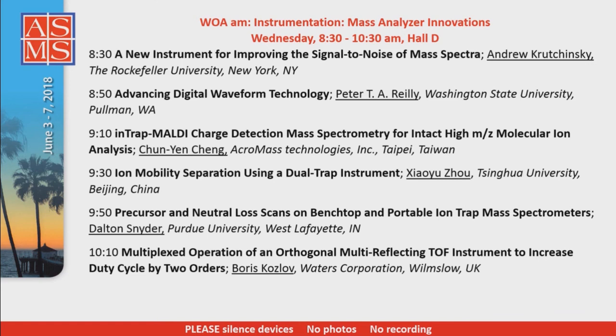I have one question. How long does it take from the time you say, okay, change, to you actually changing what's coming out? Is this a chromatography time scale, or is it much slower? It's a fraction of a second. Fractions of seconds? Fractions of seconds. Interesting. Thank you.